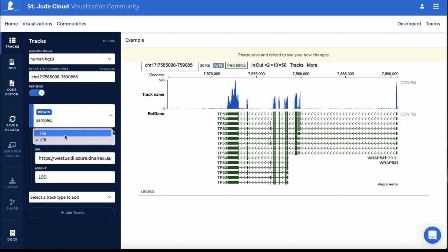Each track either accepts a public-facing URL or a file path for the St. Jude HPC within the TP directory. To understand further how to enter your data here, navigate to the documentation of our help guides and read specifically about each track under the code block library. I will also discuss this in more detail in a later video, specifically for the help guides and where to go for your data management.